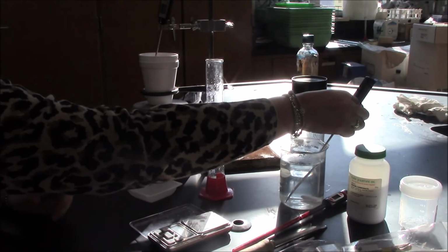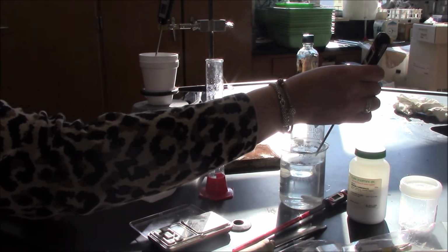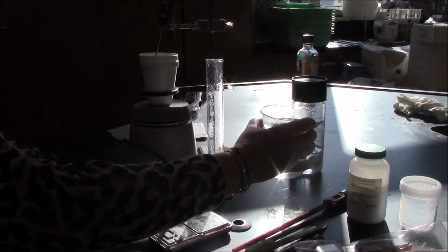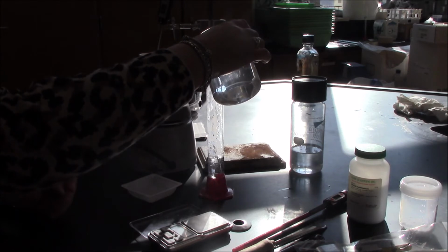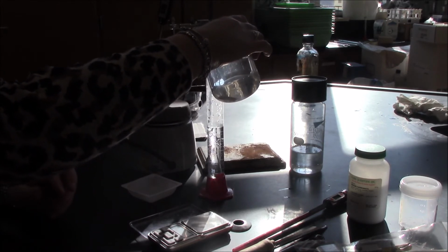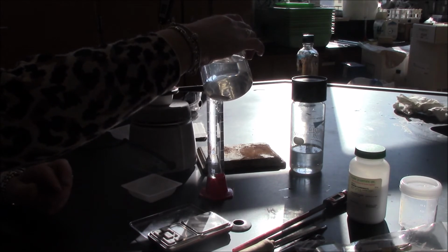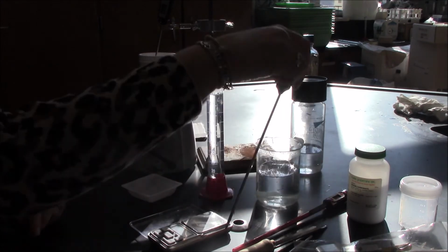I'm going to give it a minute to equilibrate, and in the meantime, I'm going to measure some warm water out in my graduated cylinder. Again, I'm looking for 100 grams or volume of 100 milliliters. Now, they suggest that the temperature of the warm water be about 50 degrees Celsius, but I was a little overzealous here. Let's see what we got.